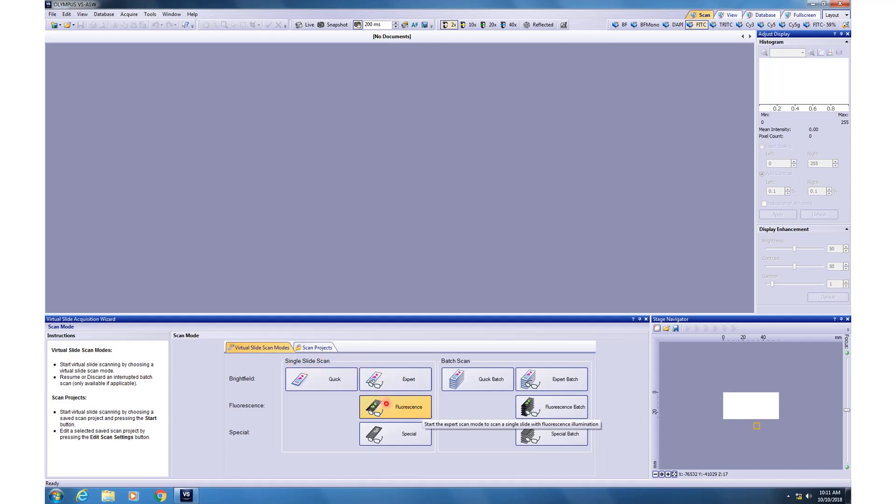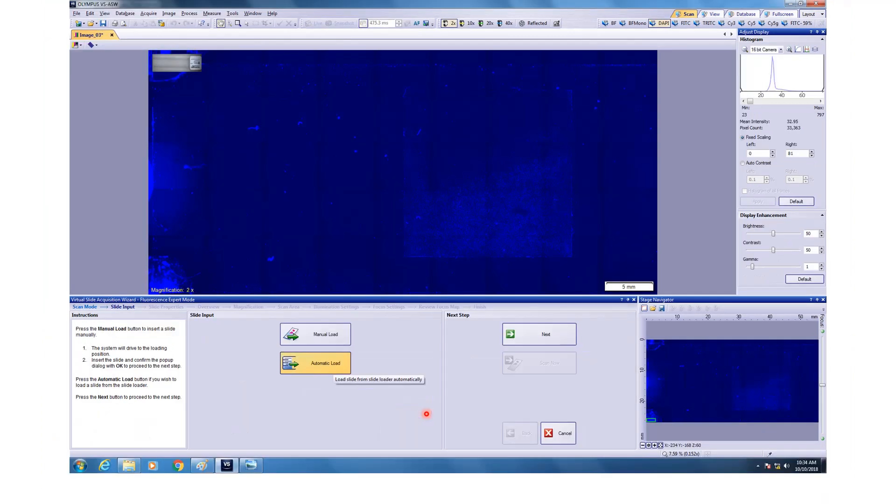Whatever we did for the bright field batch scan will be the same thing which will be applicable for fluorescence batch. So let's focus on fluorescence imaging. If you click on this button, then it will again ask for automatic load or manual load. Let's do automatic load.